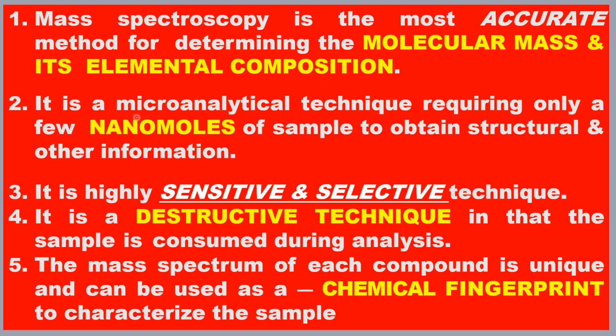Next, it is a microanalytical technique that requires only nanomoles of sample to obtain structural and other information. It is a highly sensitive and selective technique.